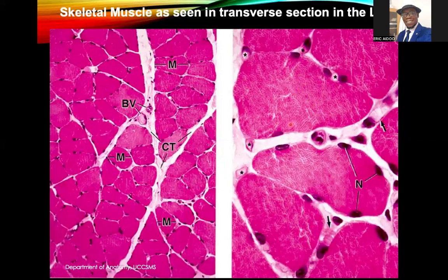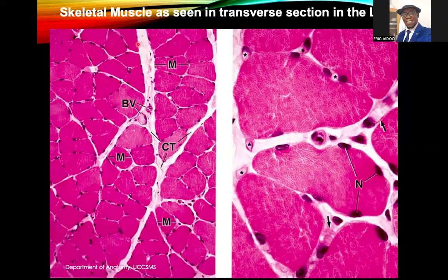This is a transverse section as well. You can see the multinucleated appearance. Here too, you can see one, two, three, four, five nuclei. And then you can also see those profiles like dotted pink spots representing the myofibrils. Because it's a zoomed-in section, you will not find the epimysium covering the entire muscle tissue. You can see the perimysium there and then you can also see the endomysium.